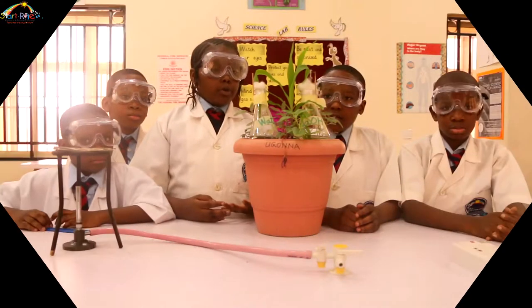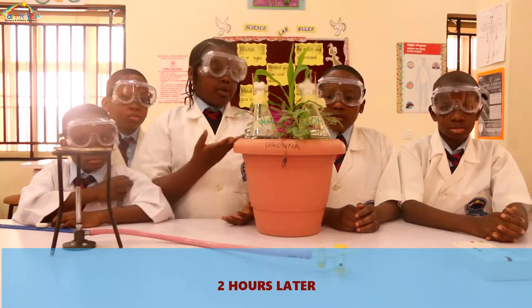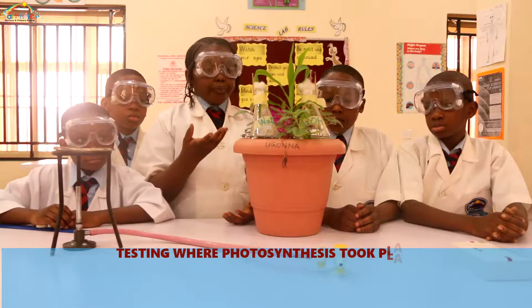We are going to find out whether photosynthesis took place in the one with sodium hydroxide or the one with water.